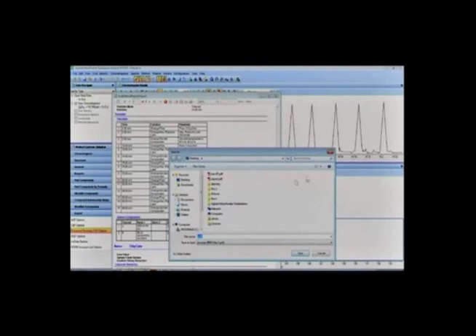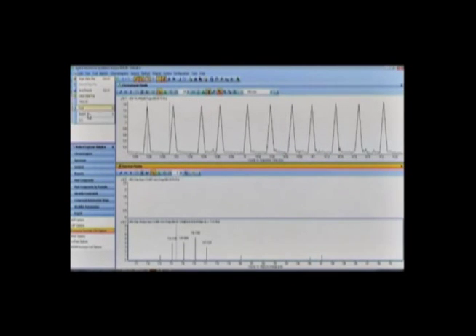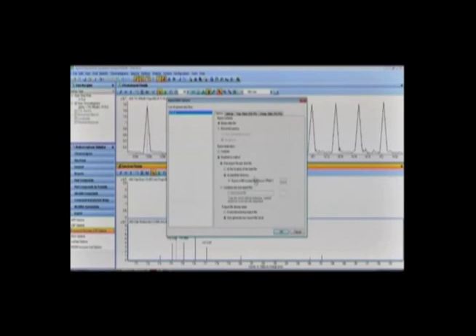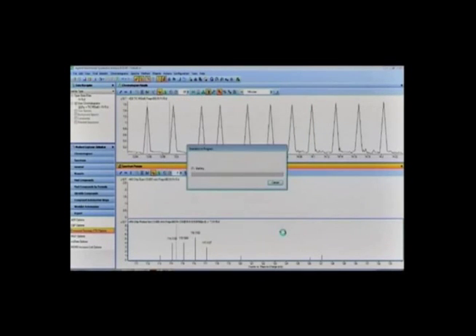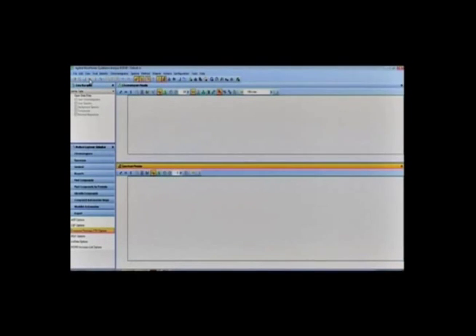Click on export and you can convert the mass spec data file, the .d file, into a Mascot generic file, the .mgf file, which can be used for analysis using Mascot. Finally, we can close the file by clicking the folder icon given in the qualitative analysis window.